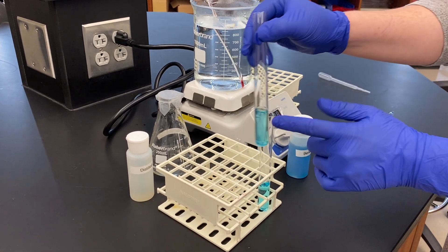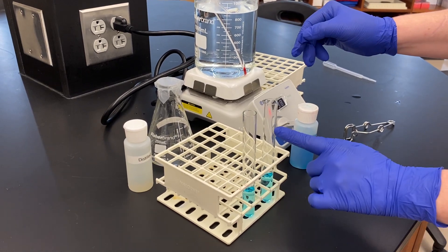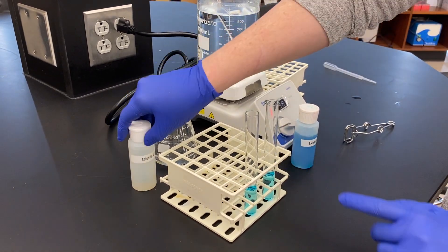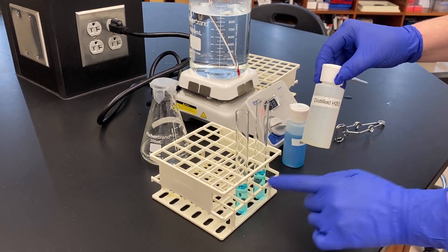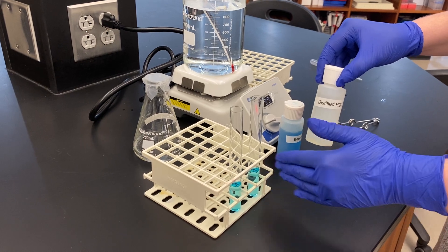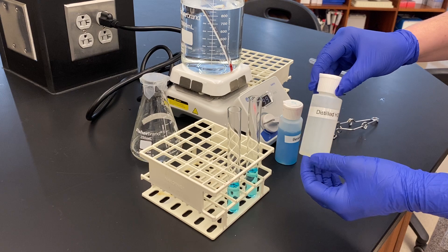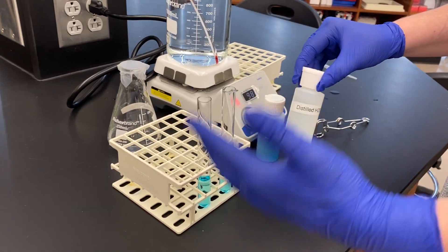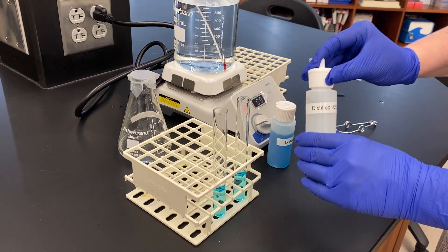What we're going to do is we're going to have controls in this example — a negative control and a positive control. For the negative control we're going to use DI water. There should be no sugar at all in this tube. It's really important to have these controls to be able to compare to your unknown samples. A negative control is always going to be the one that doesn't have a reaction, using DI water.